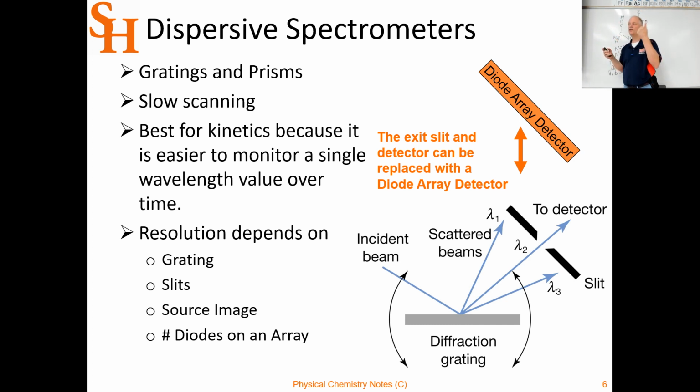And that increases your noise. Your signal to noise ratio gets poor because your noise goes up or stays the same and your light goes down. So your signal drops, your noise stays the same, and your signal to noise ratio is garbage.